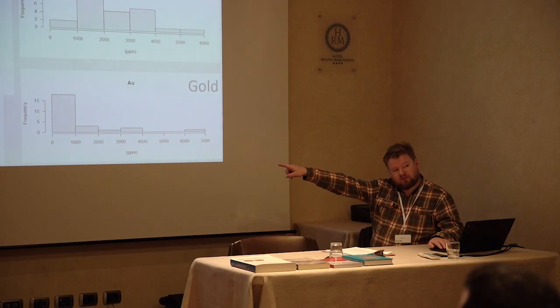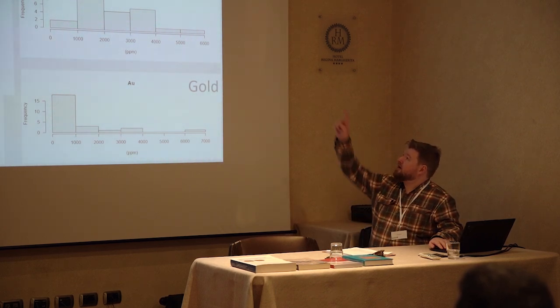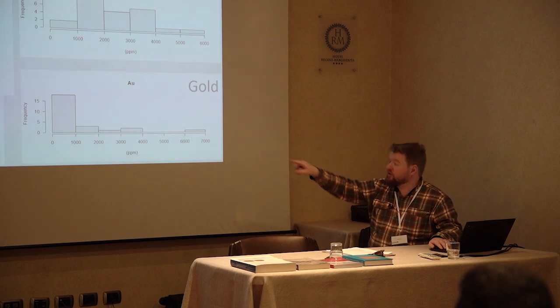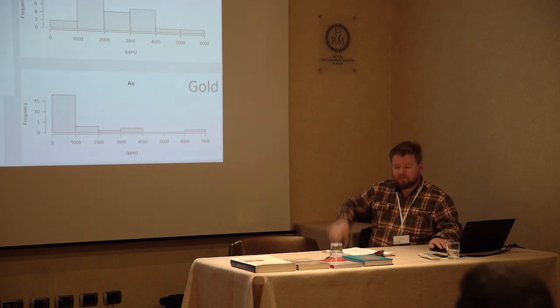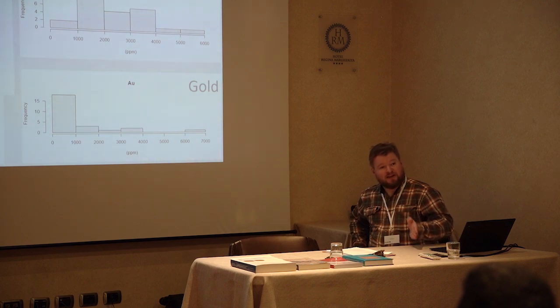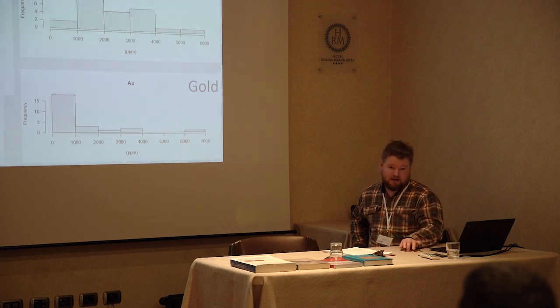This is important for us to understand, because when we're doing our isotope analyses, we are looking at the lead. We're not actually tracing the silver, we're tracing where the lead comes from. So we're always isolating the lead part to get the isotopes. So if the lead has been added, then that's very interesting, but we're still provenancing where the lead comes from.